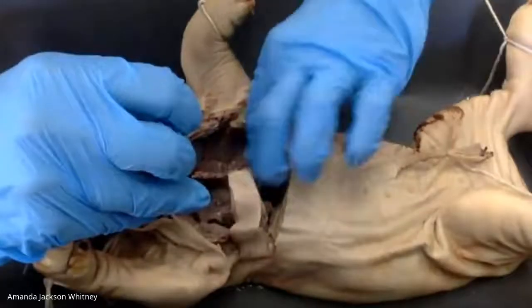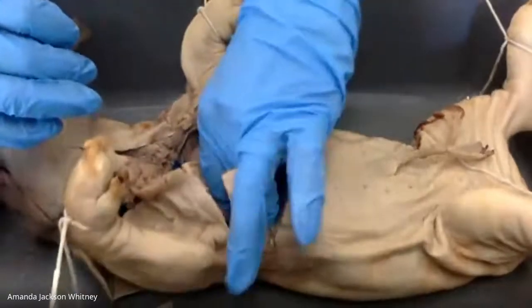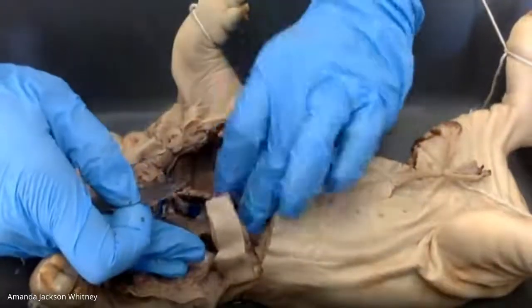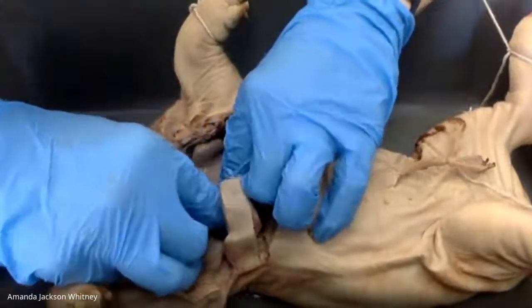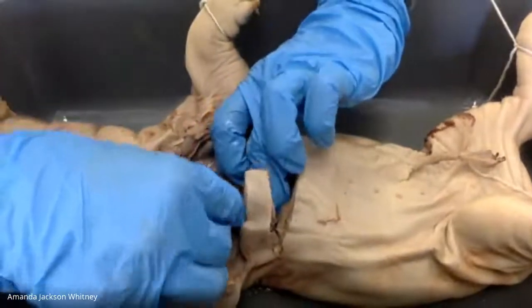So, here we go. I'm going to try and lift these up and out. They look small from this angle, don't they? Don't they look tiny? They look so small. So I'm going to just cut away at the tissue that's holding the lungs in here. This is the parietal pleura.